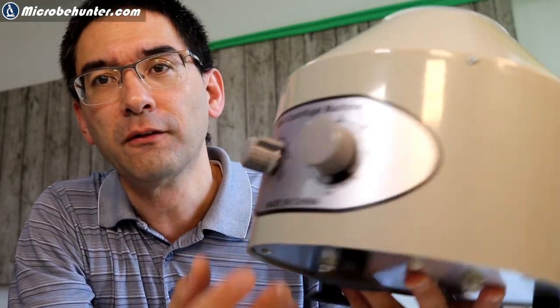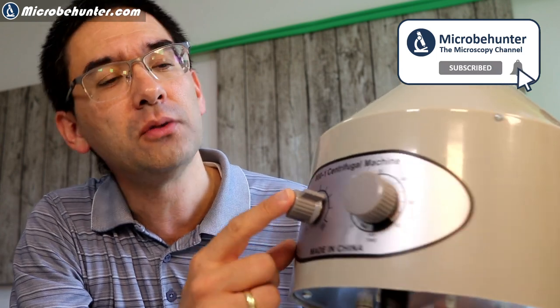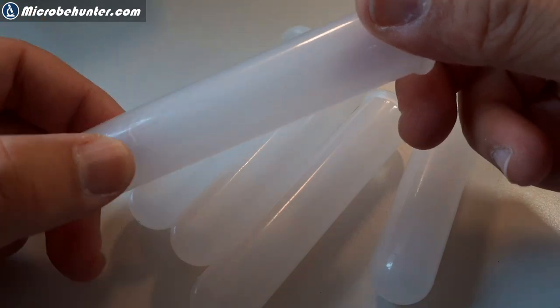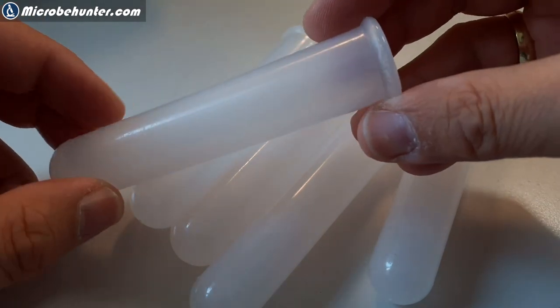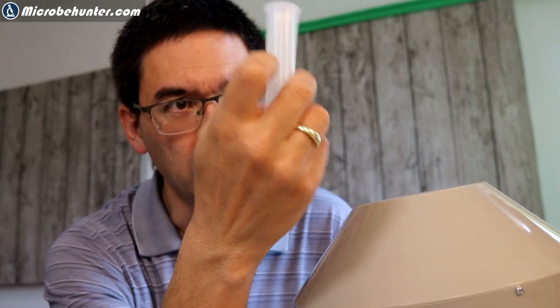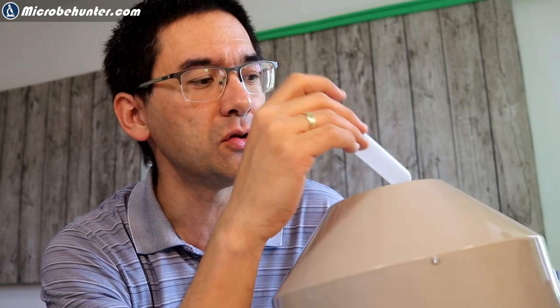This is how it looks from the front — made in China, obviously, otherwise you won't be able to get it that cheaply. I think this is the speed dial that you can use to select the speed. And there are six tubes. They're made of plastic. I think I might get maybe glass ones as well, because it's a little bit difficult to see the pellet since the plastic is not completely clear. But I think that's not so much of an issue.